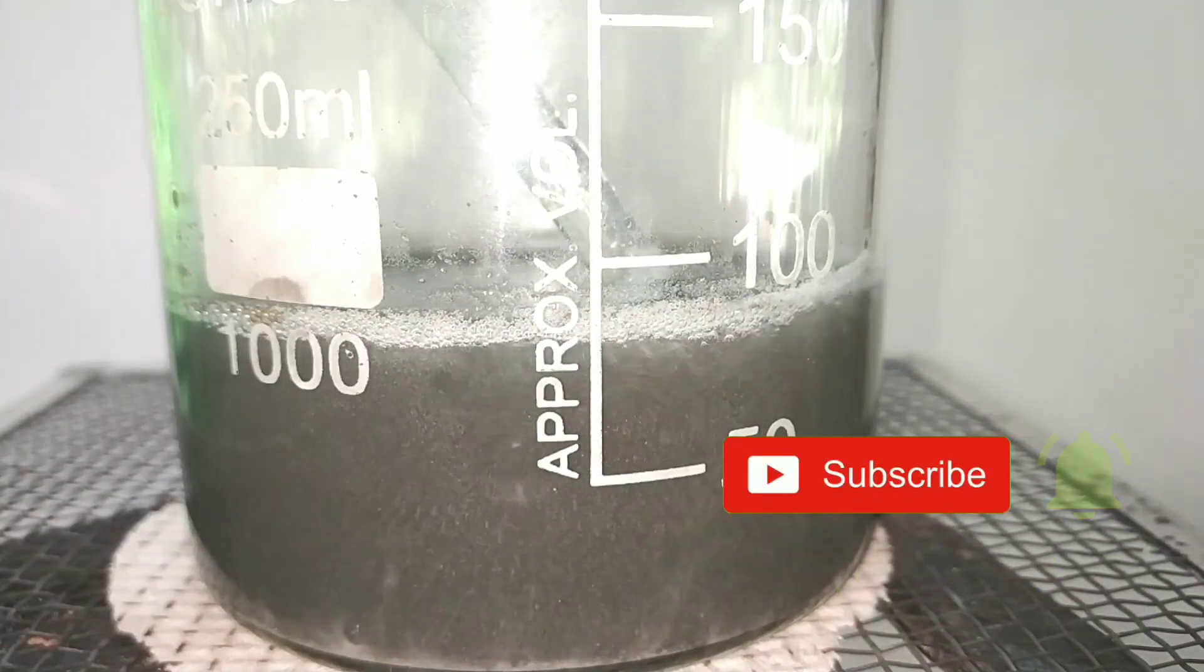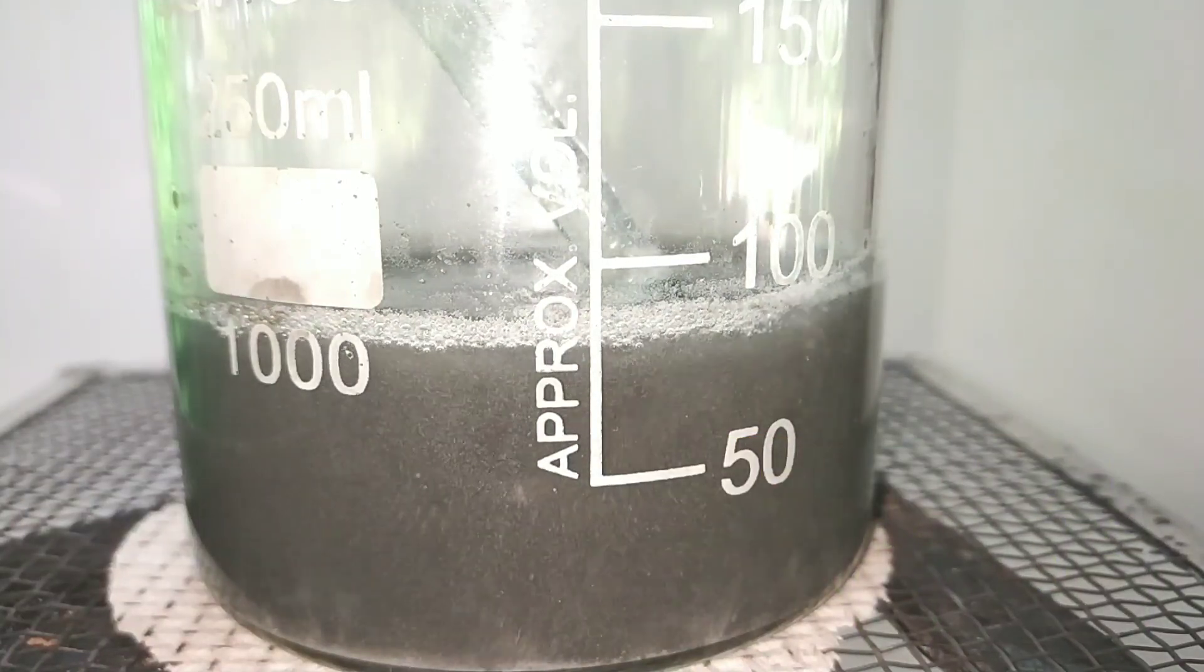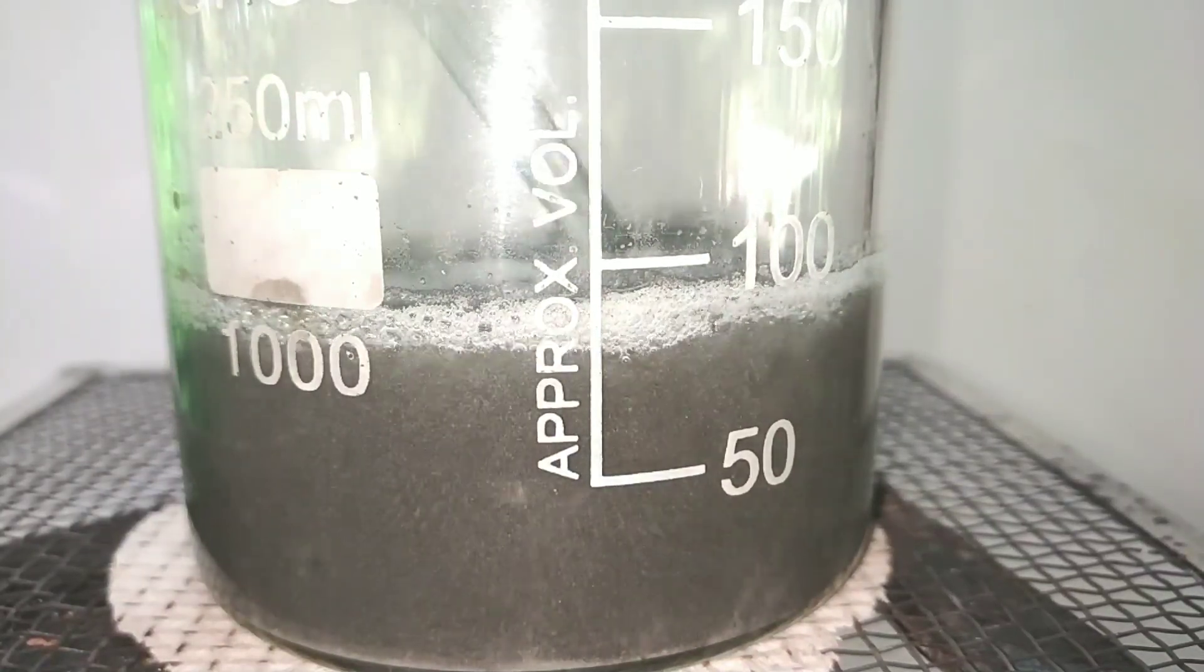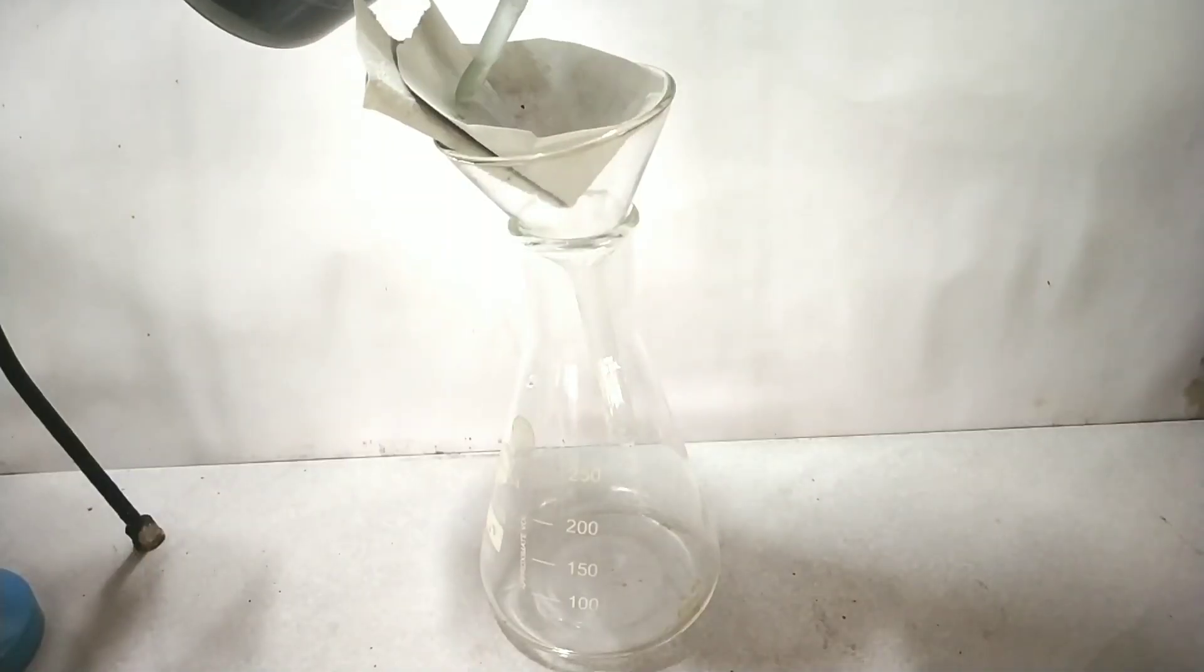To augment the reaction forwards I heated the solution. As you can see the solution has turned dark. This is due to the presence of high concentration of iron 2 sulfate and the unreacted iron oxides.